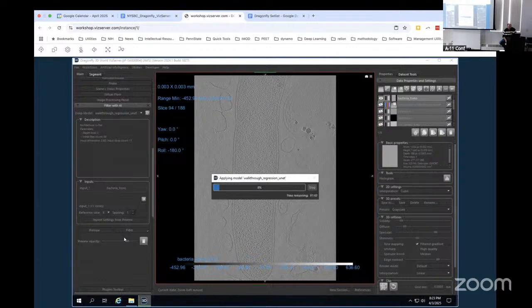the other denoising networks. I have not done a lot with CryoCare or even ISONet. I've done a little bit of ISONet, but it seems like you have to train new models fairly frequently to make it work on your data set. Or are you able to train a generalized CryoCare model that just works for everything? Does anyone use CryoCare? I don't. I just wonder. ISONet, you do it in batches. Like you would have a bunch of tomograms that you would train on all at once?